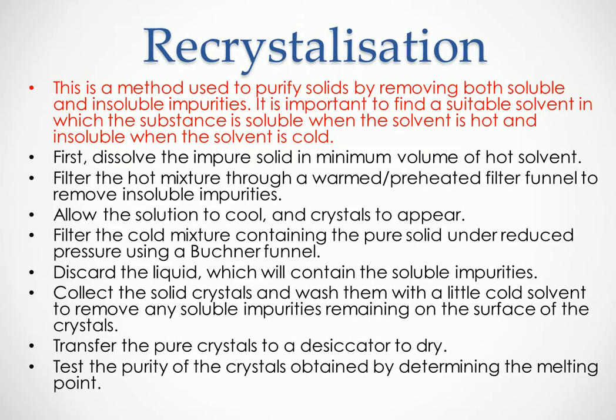Once you do so, you just compare it with a databook value and look how far off the melting point is from the actual value in the databook of the substance. Once you do so, you'll find out how pure it is. If it's really off the value, then it's not pure, and we need to do the process again or do a different technique. But that is basically the whole point of recrystallization and how we do it.